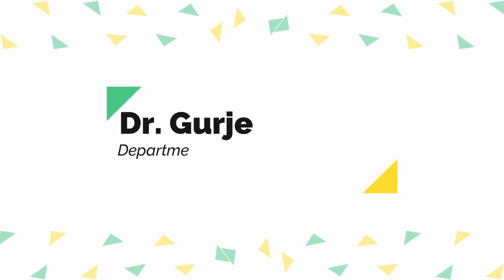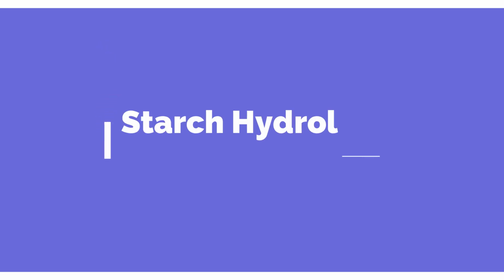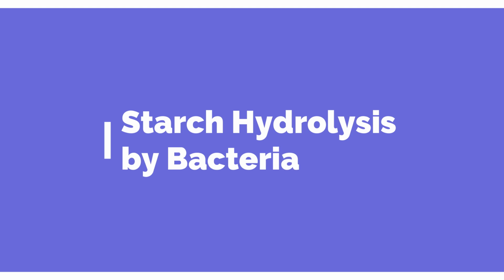Everyone, I'm Dr. Gurjeet Kaur, and in this video we will be discussing starch hydrolysis by microorganisms, mainly bacteria. I've tried to make this video as comprehensive as possible. So before we start this hydrolysis experiment, let's quickly see what exoenzymes are.